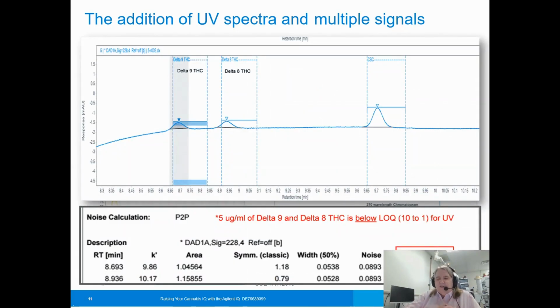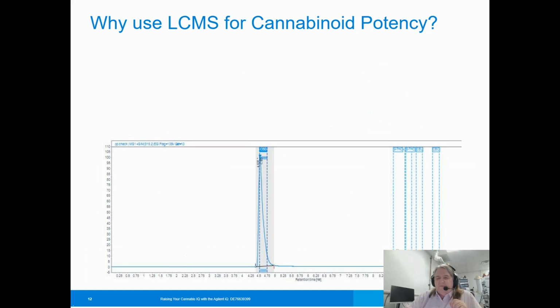So let's look at our signal to noise ratio. In this case, it's 7.1 and 7.4. So I'm pretty confident in using these for LoD and LoQ. Typically for LoQ, I'm a little below 10, but a little above 5 or 3 rather. So I'm quite pleased with that. But again, remember these LoQ and LoD because this is going to come in handy later.